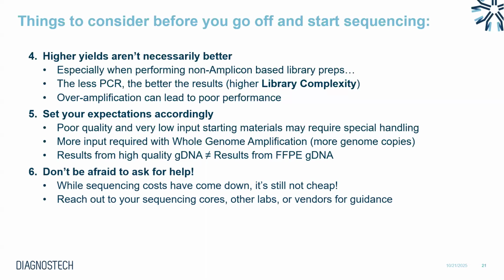Lastly, don't be afraid to ask for help. While sequencing costs have come down, it's still not cheap. Reach out to your sequencing cores, other labs, or vendors for guidance.